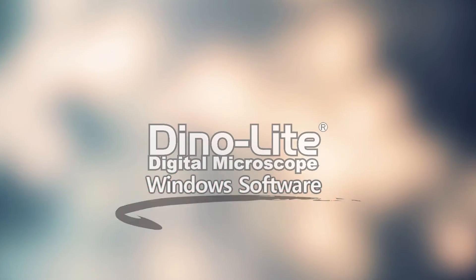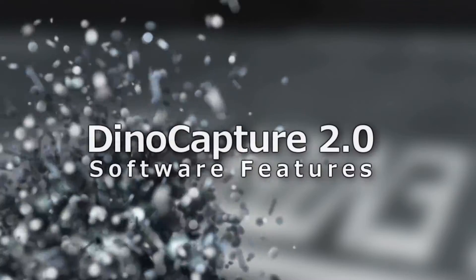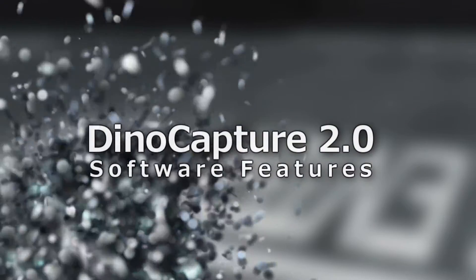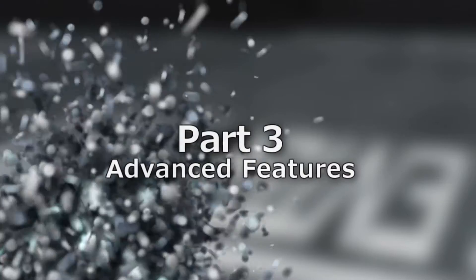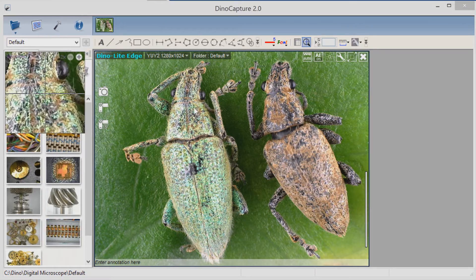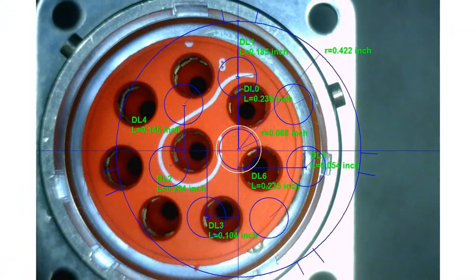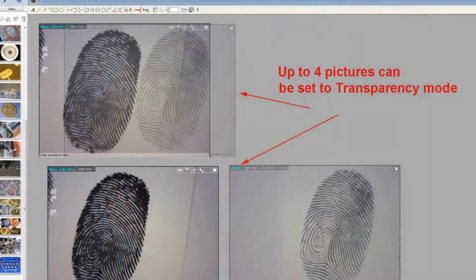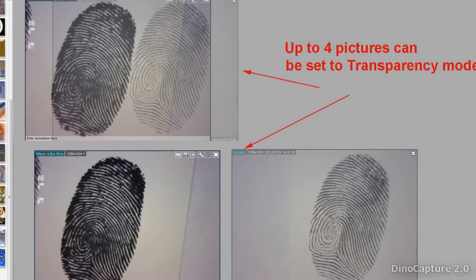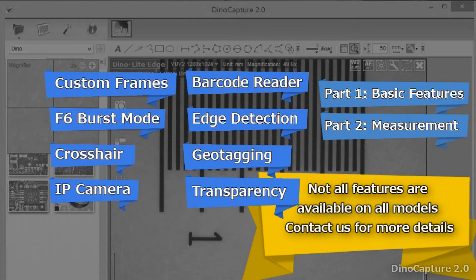This is the DinoCapture 2.0 Software Feature Tutorial Part 3: Advanced Features. DinoCapture 2.0 is a Windows software for Dino-Lite microscope cameras. In this video we will go over some of the advanced features within the DinoCapture 2.0 software. You can skip ahead to any section by clicking the corresponding link.